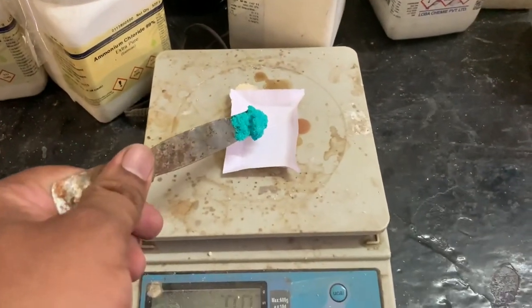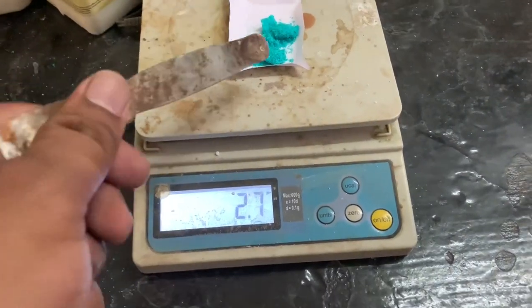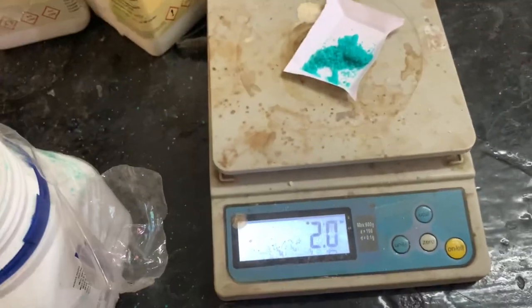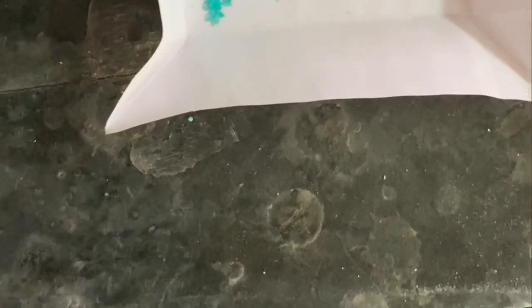Let us take the weight of nickel sulfate. We need 2 gram of nickel sulfate for the synthesis of nickel hexamine sulfate. We will synthesize nickel hexamine sulfate from nickel sulfate. So the process is to take 2 gram of nickel sulfate and dissolve it in 5 ml distilled water.